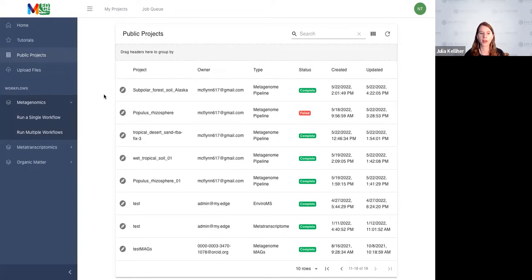So we're doing this kind of cooking show style. Karen Davenport, who's on the call, that's her favorite term for these things, so I'm stealing that from her. If you started your project, we can't wait for everyone's projects to finish, since everyone submitted them at the same time. It would take a very long time, and we can't do that within the time frame of this workshop.